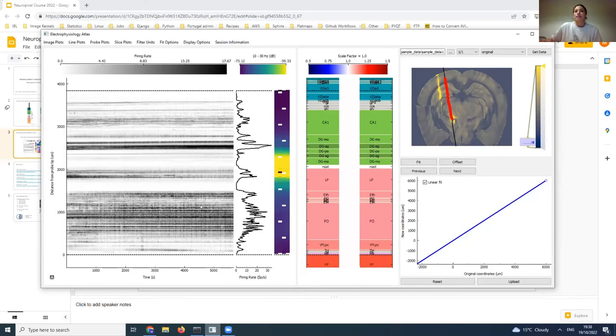Everything in this tool is based on reference lines that I was referring to earlier. These can be added by double-clicking on one of the panels, and you get a pair of reference lines on the electrophysiology panel and also on the histology panel. These can basically be moved so that you can align regions that you think should match. In this example here, we can see on the bottom of the probe that we have quite a high firing rate which then stops quite abruptly around 1500 micrometers up.